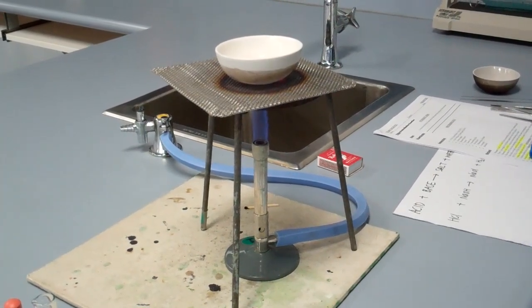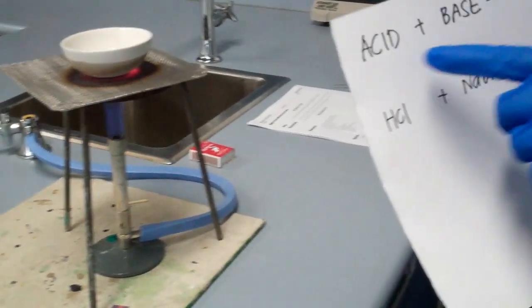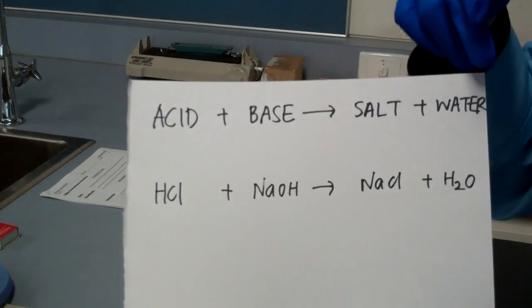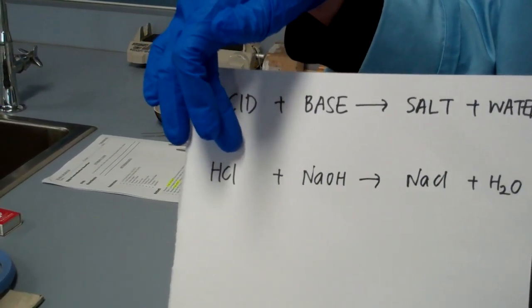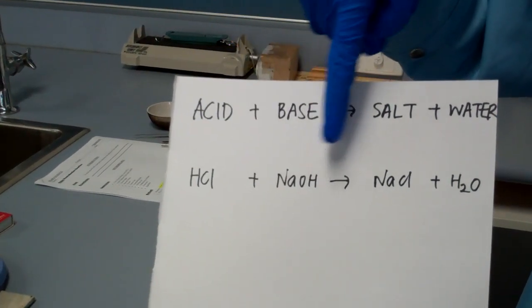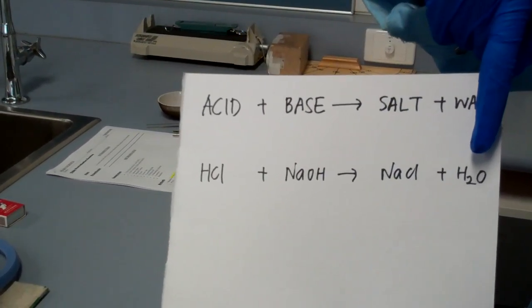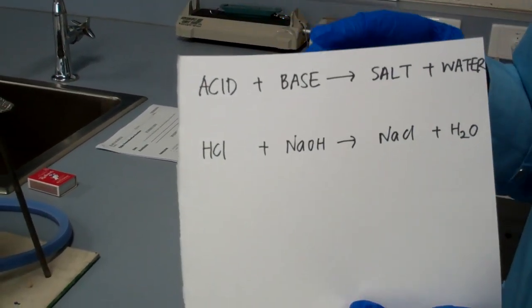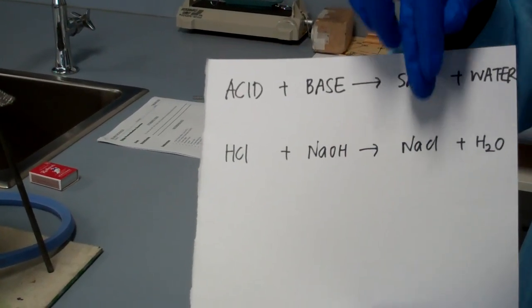While having that going, if you look back at the reaction, you have acid plus base, and all acid plus base reactions will give you a salt and water. In this case, the acid that we are working with is hydrochloric acid, and the base is sodium hydroxide. With these two, you should form a salt, which is sodium chloride, and water. So when we evaporate the water from the evaporating dish, we should be able to get a solid from the reaction, which is the sodium chloride.